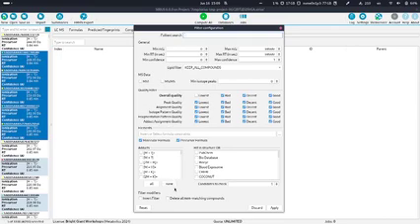It's unfortunately not very big, but there's an option at the very bottom which says delete all non-matching compounds. And if this is enabled, you will delete everything which is not in your view. But normally, the default is to not enable this checkbox, and then stuff will not be deleted from your project space. You will be able to analyze it later on.